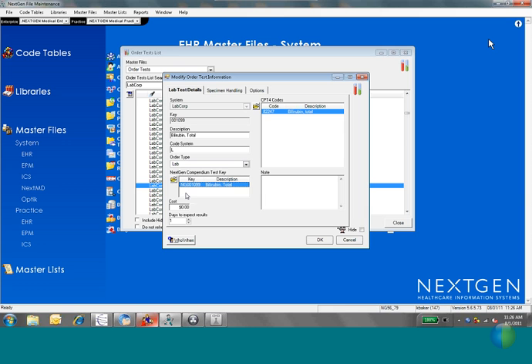So then that takes us to, let me check the chat board here, that takes us to the CPT codes and the cost. And the CPT code is needed if you're going to be utilizing the medical necessity feature with the orders module. That's actually a separate webinar as well, and it's actually a separate utility and license altogether. But if you do choose to use medical necessity with the orders module, it can't use it without the CPT code for the test. So this one is something that you're also going to have to do manually.